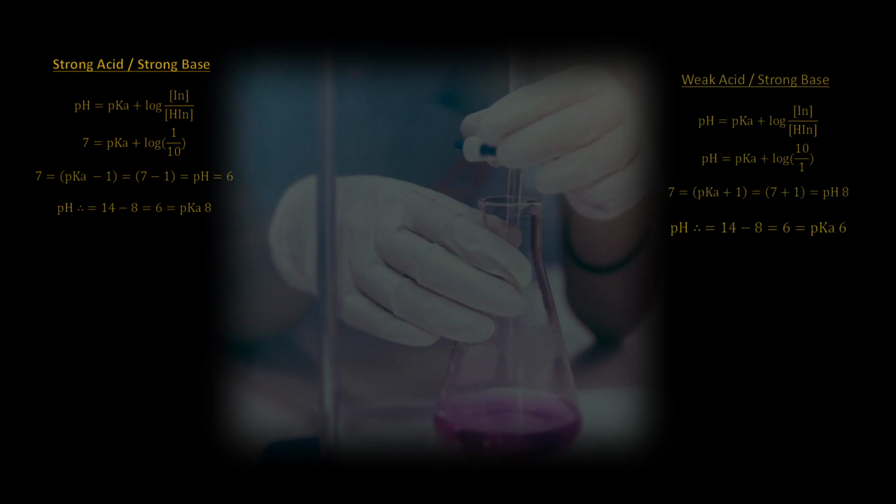As shown and illustrated, it requires two different indicators for each of these titrations. In practice, the first color change will not necessarily happen right at equivalence. The indicator, however, must be able to change color when the equivalence point is reached. A good indicator of choice begins to change color after the volume of titrant reaches the equivalence point.